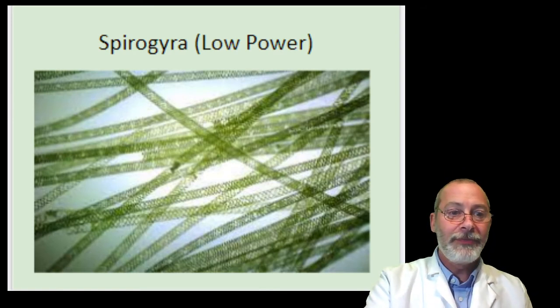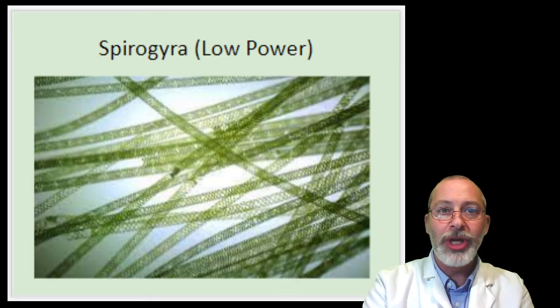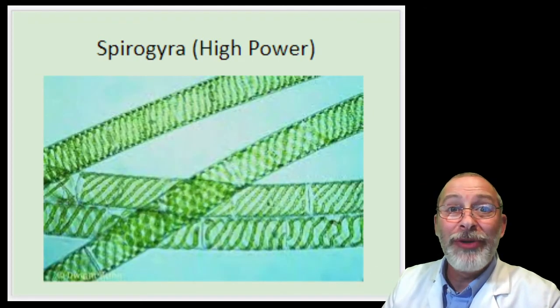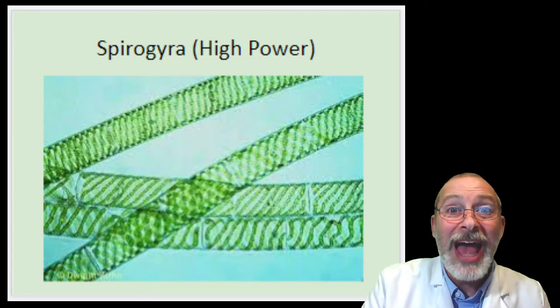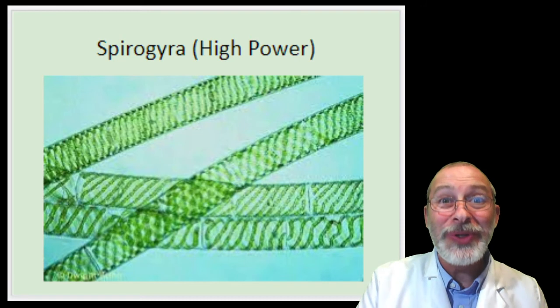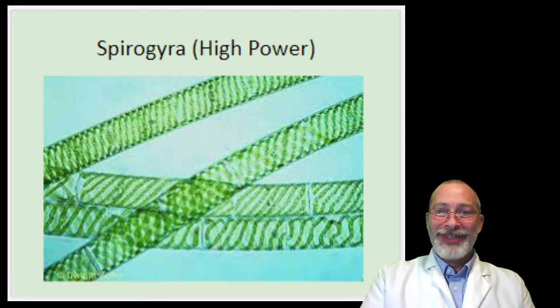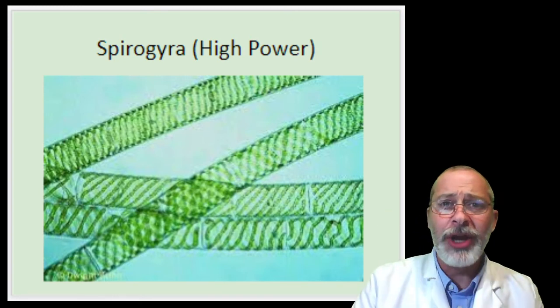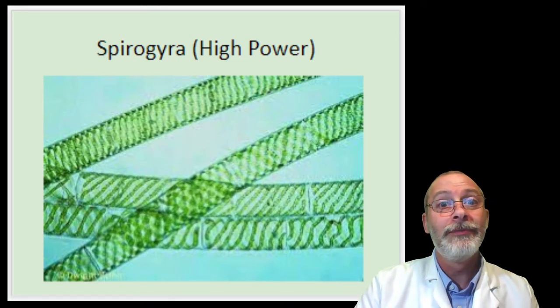And next, I got so distracted with the cool Spirogyra, I was hitting the wrong buttons. Here's Spirogyra under high power. Check it out. Does this look cool or what? Can you see why it's my favorite? Kind of looks like a slinky, doesn't it? All right, Spirogyra under high power. Pause the video and make your observations.